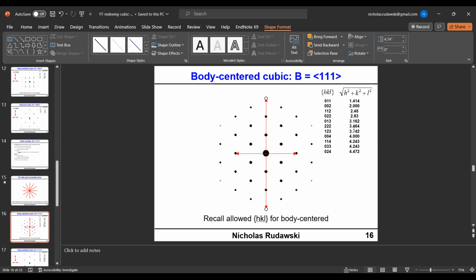And we want to see, again, not only if we get anything close, but if we get a close match, we want to see if we can mathematically get the two G vectors to dot to 0, okay?